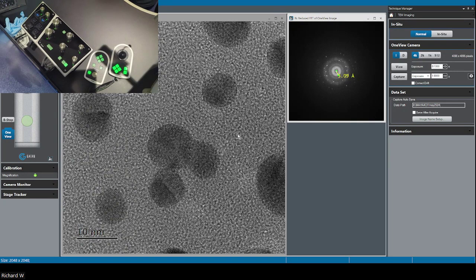Now, there's two ways you can get around it. The first is you sometimes have the platinum region on the top. So when you make the FIB sample, you deposit platinum in the FIB, and that's not a continuous film of platinum. It's quite discrete, and in between, it's filled with amorphous carbon or amorphous carbon and platinum.